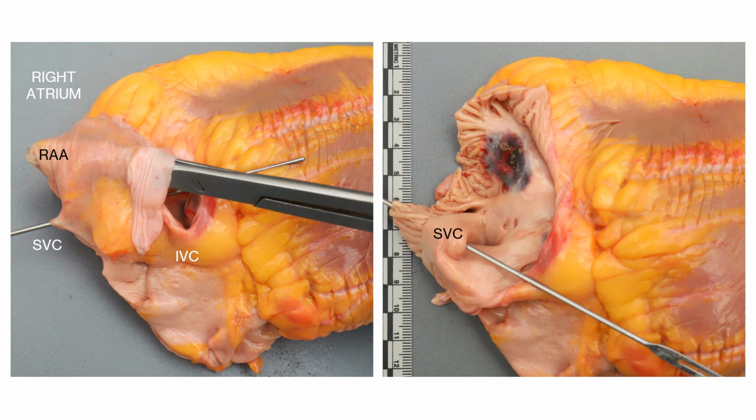Okay, so now that we've cut those sections, we can start performing flow of blood. So if we follow the rules of the heart, we know that blood enters into the heart via the vena cava into that right atrium. So the first thing we do is we will open the IVC into the right atrial appendage. You see me probed within the superior vena cava.